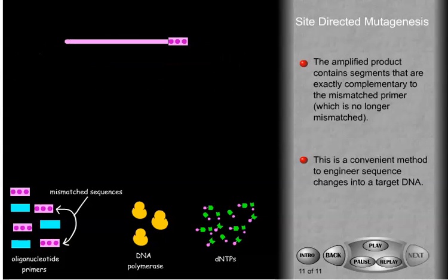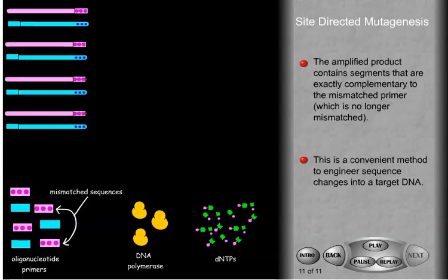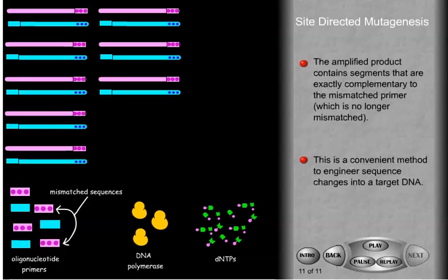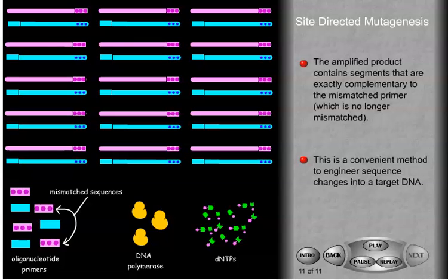When they in turn become the templates for synthesis, the resulting duplex DNA has the mutation in both strands. Because of the amplification power of the PCR process, the final reaction contains almost all mutated sequences. This is a very useful method for making changes in the sequence of DNA. If the mutated DNA encodes a protein, then this same technique can be used to make genes, which encode proteins with mutated sequences.